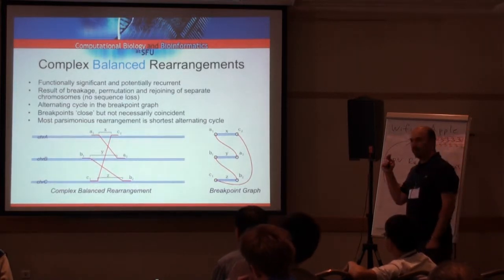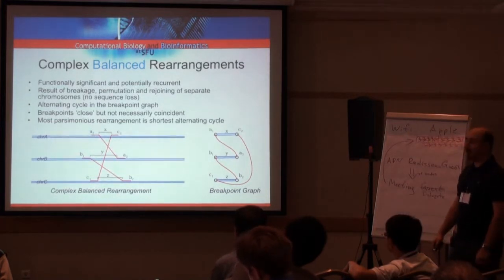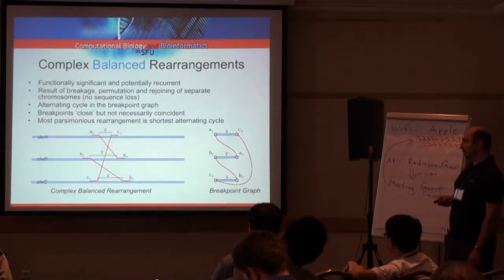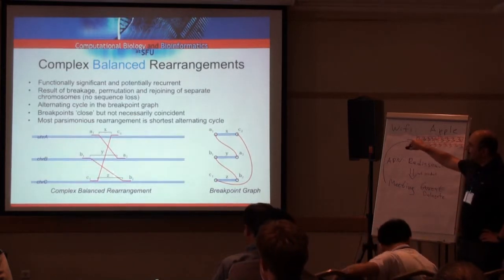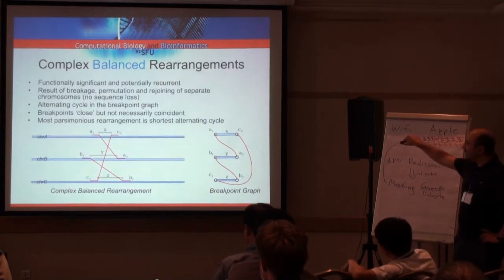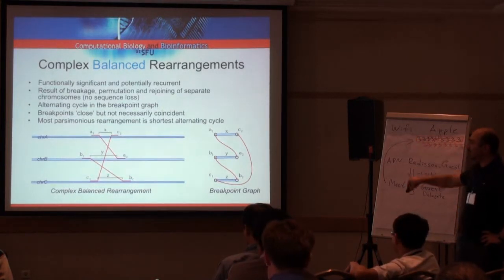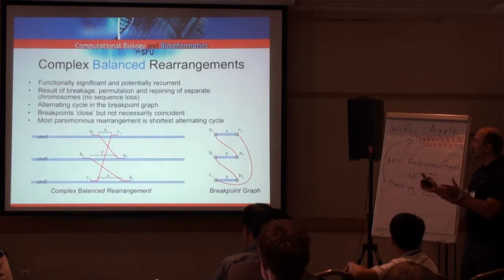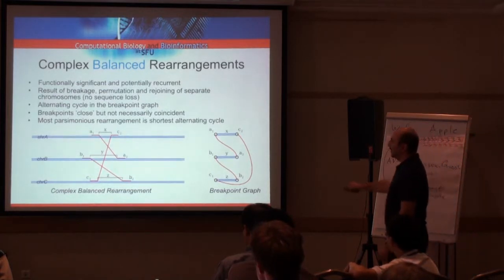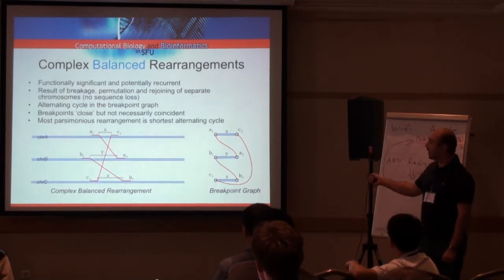And to be able to find these corroborated fusion events, we had to come up with a combinatorial optimization problem again. Note that many of these cases are not expressed. Although we know that there is a fusion, say, between B and C involving regions B1 and B2, it may be possible that they are not expressed at all. So you have to somehow use both genome data and RNA-seq data to be able to find the cycle and the single event that seems to explain what's going on.